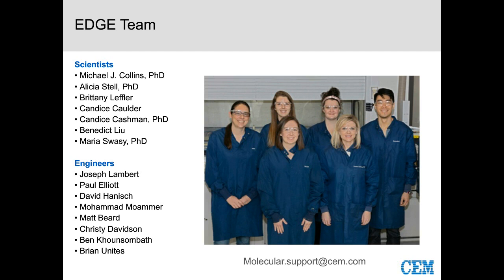I have a related question here. I'm not sure if this was just answered, but I'll ask in case. Does the sample need to be completely dried? So no. I mean, maybe for best results, right? This is a preliminary study, and so how much the water content in the sample may be affecting the results is unknown at this point. But what you'll note is that we did dry the package samples in an oven to remove any water content there. However, we didn't dry the cucumber. And the cucumber obviously has a very high water content.